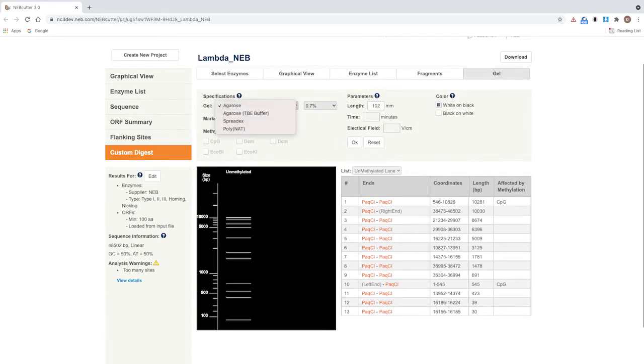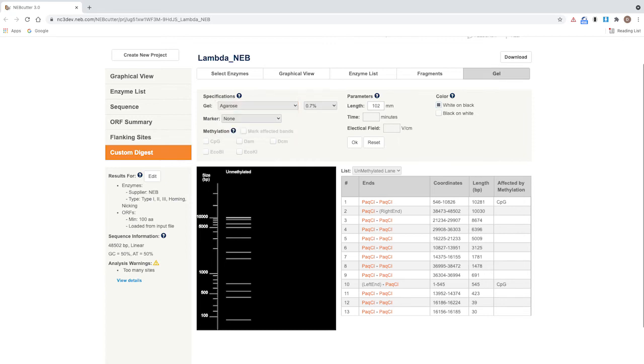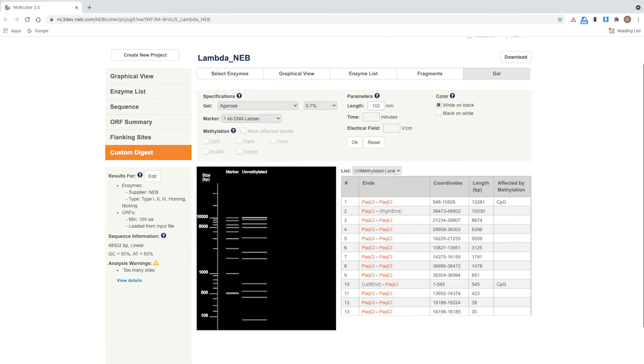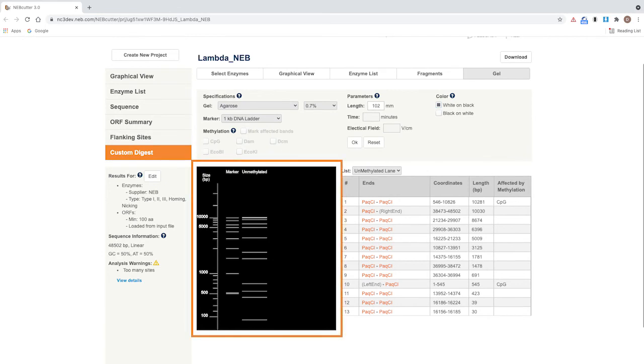You can select the type of electrophoresis gel that you are using with your samples, as well as the percentage. You can include a DNA ladder marker on your virtual gel using the drop-down selection menu. Let's use the NEB 1KB ladder as our marker.